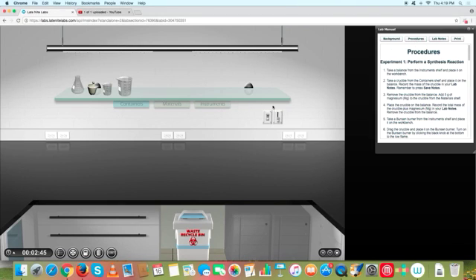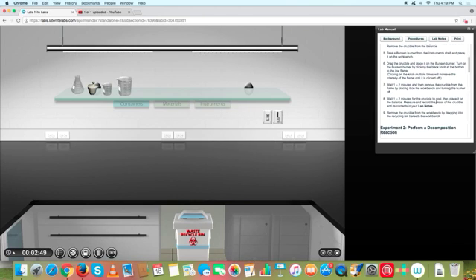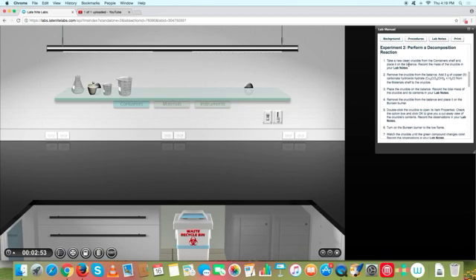I'm not going to do the whole procedure for everything here. I'm going to do a portion of some of these just to give you an idea about how to handle some of the actions. I'm going to start with experiment 2. It's kind of similar to experiment 1 and uses similar kinds of manipulations. So it says take a new clean crucible from the container shelf, and there'll also be a balance. The balance was put here in the previous step.